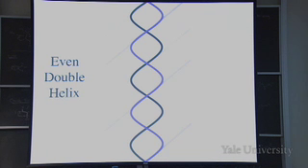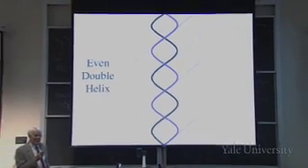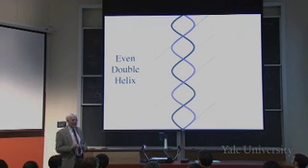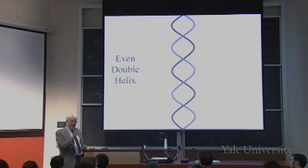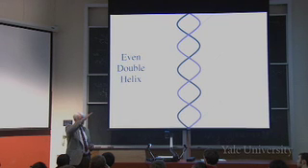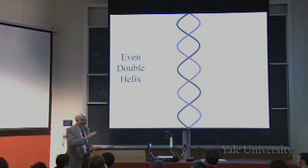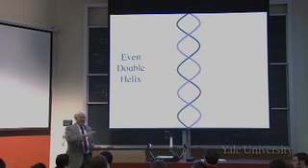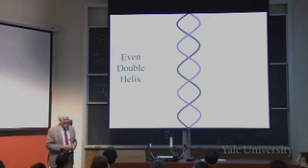How different will it be if we have a second helix wound halfway between the first helix? From one helix we had 1, 2, 3, 4, 5, 6, 7, 8, 9 angles, right? What happens now? You only see the even numbers? All the odd ones disappear, right?